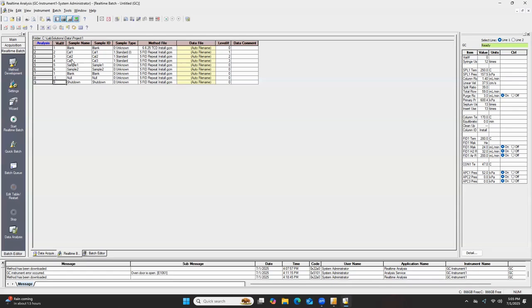As for the shutdown, I know that y'all had a shutdown procedure at the end of your batch tables for the IC. Essentially what the shutdown method is, you say it's a lower flow state.